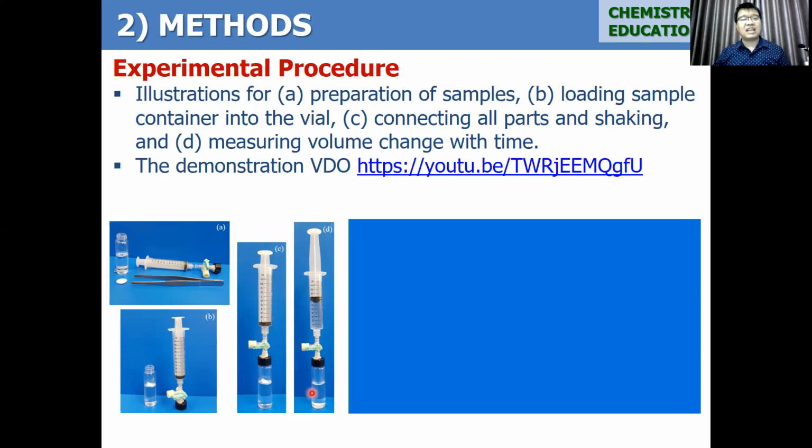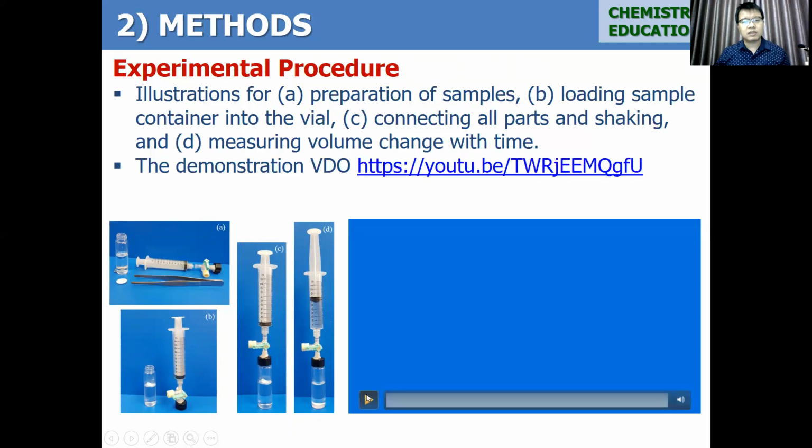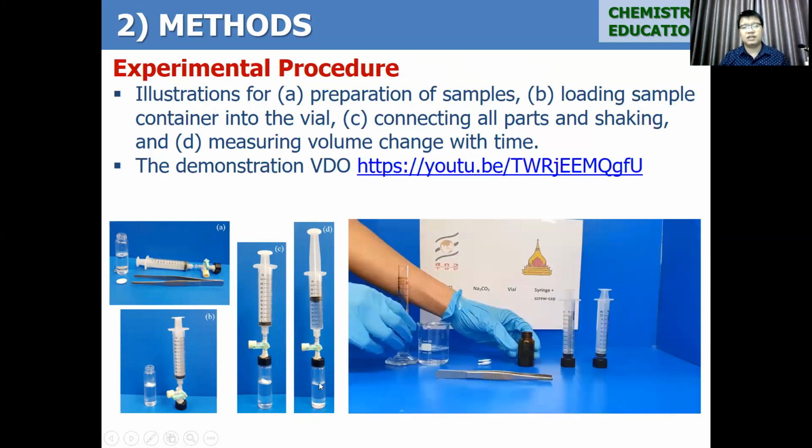And the last one, measuring volume change in the syringe with time. The demonstration video of how to proceed with this experiment is as follows. Let's see the video.